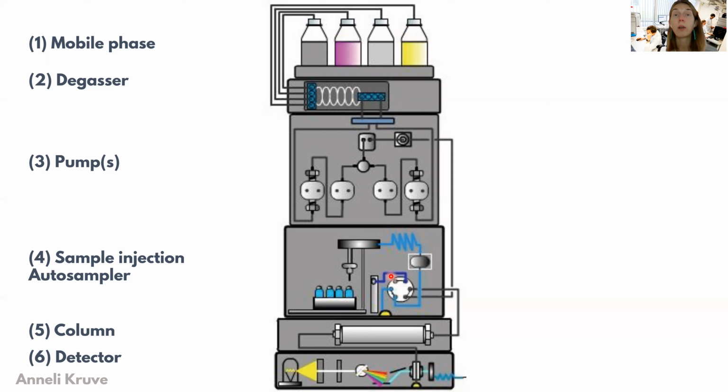Usual sizes are somewhere between 5 and 20 microliters. But slightly smaller injections can also be made, or larger injections of the sample, depending on the sample and its concentration. And then this is further directed to the column. The samples are usually injected in an automatic manner today. This means that we have an autosampler which holds something like 50 to 200 samples, which can then be automatically injected and run with the HPLC instrumentation.